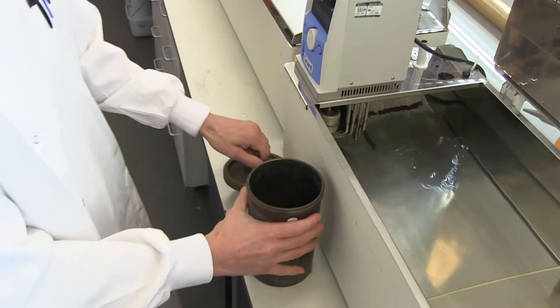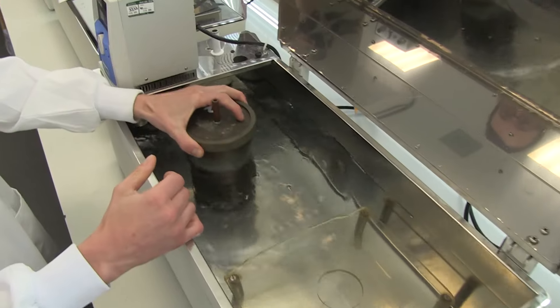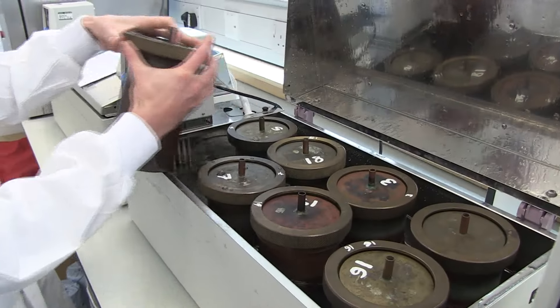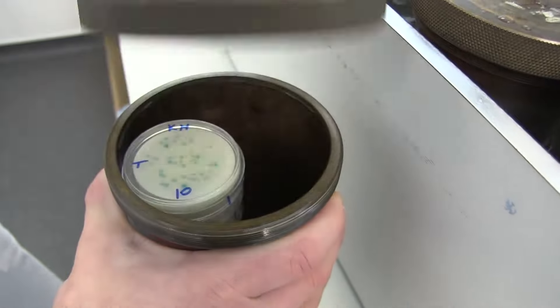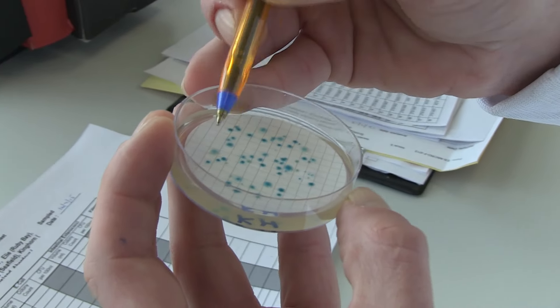We then incubate them at either 37 or 44 degrees depending on the organism overnight, and in the morning we can count the plates, multiply by the dilution factor, and this gives us our end result.